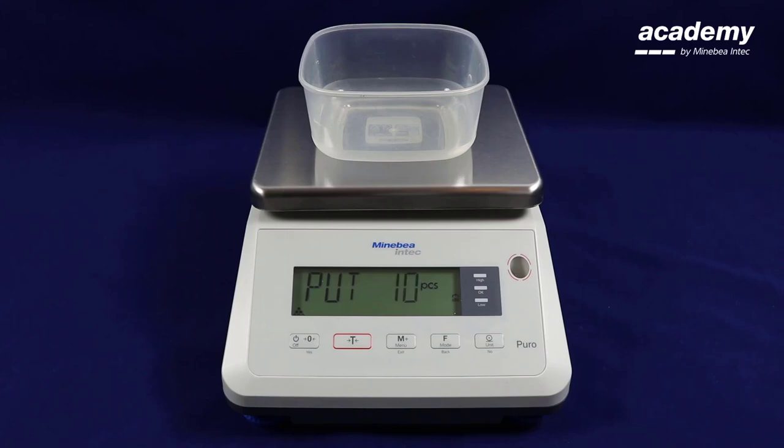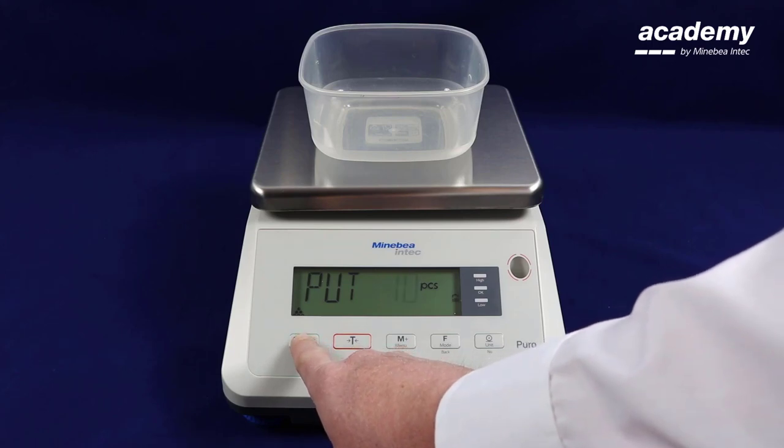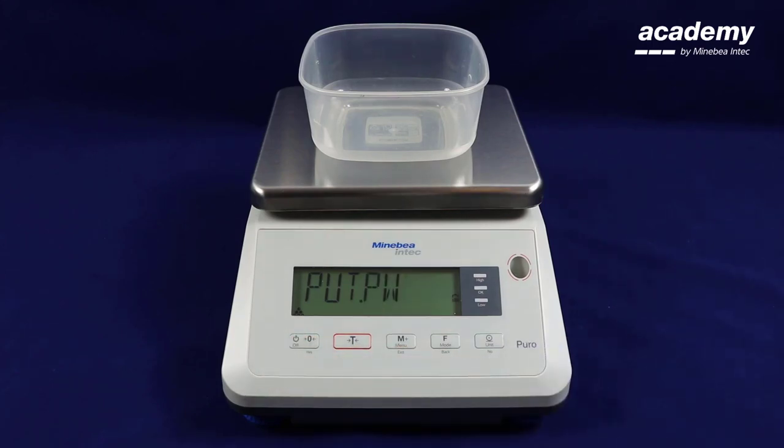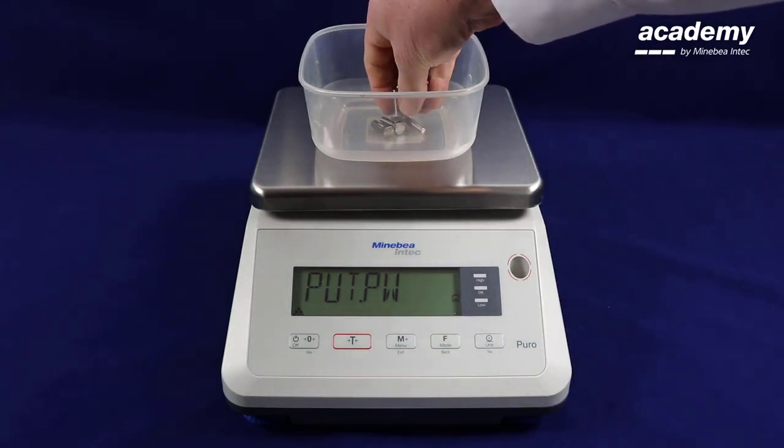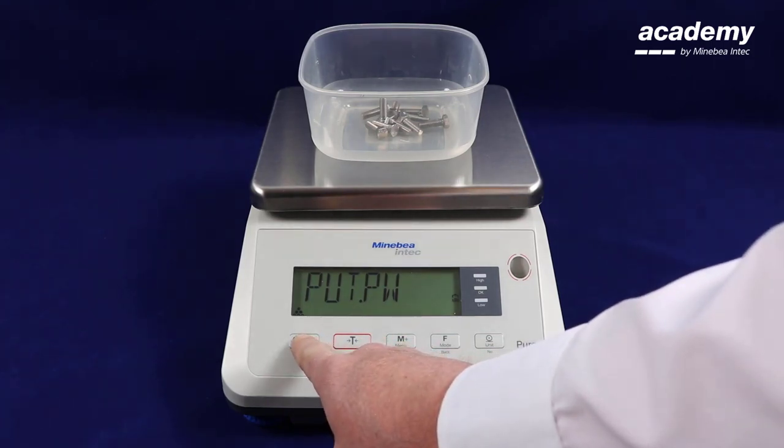For this demonstration we will be using ten pieces. Press yes to accept. The scale is now prompting you to put the requested number of piece weights in that you previously selected. As you can see, ten pieces have gone into the container. Press yes to accept.